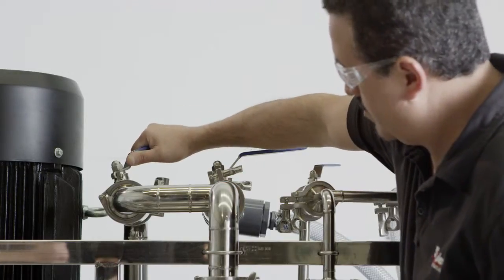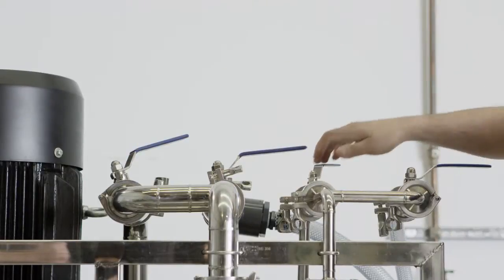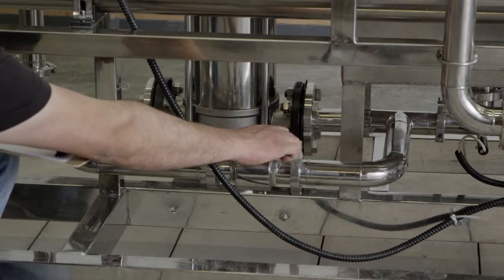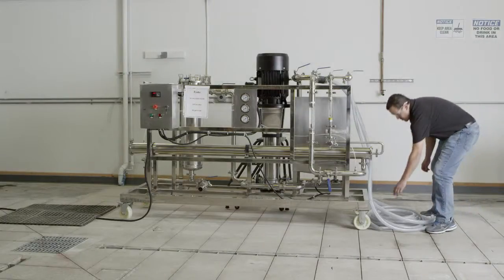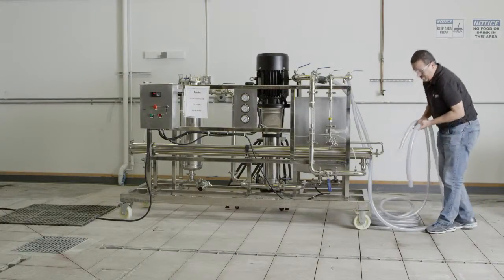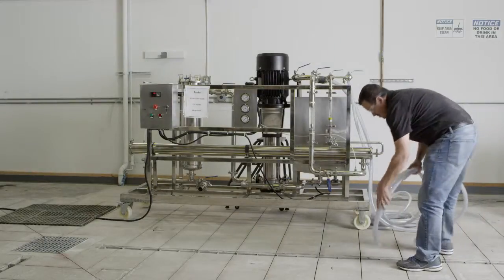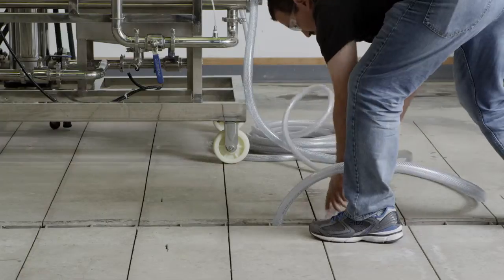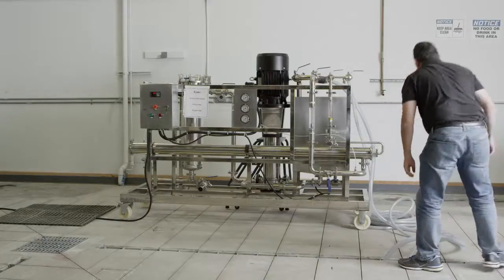Now that we are ready to continue, open all feed valves to the system. Next, open the concentrate flow adjustment valve fully open. Direct the concentrate and permeate lines to drain with flexible hosing. Before running a process fluid, it is best to first test the system on clean water to ensure that all of the individual components are functioning properly.